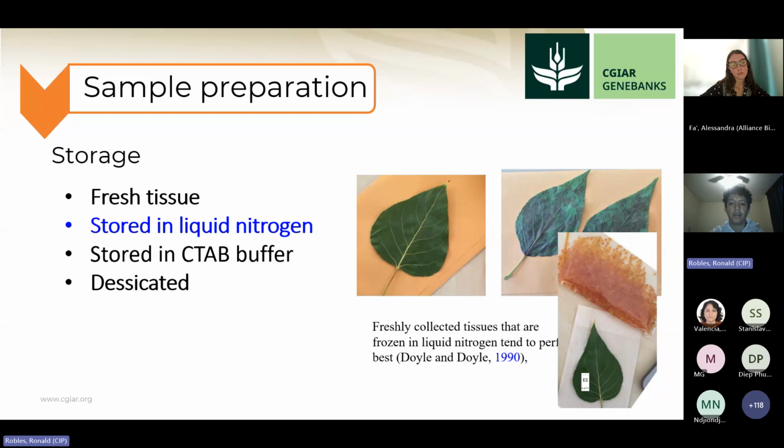This must be done with care because, as I mentioned, at the very moment in which we collect the samples, it starts to degrade. So another method is to desiccate the sample, remove as much water as possible from the sample, and do it very quickly to avoid the degradation of the tissue, the cells.